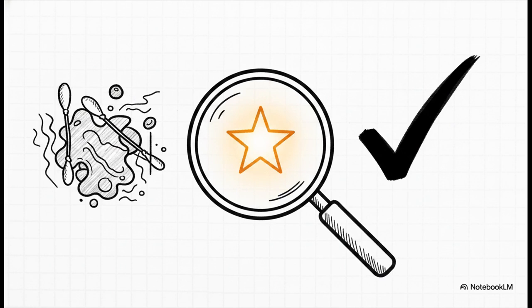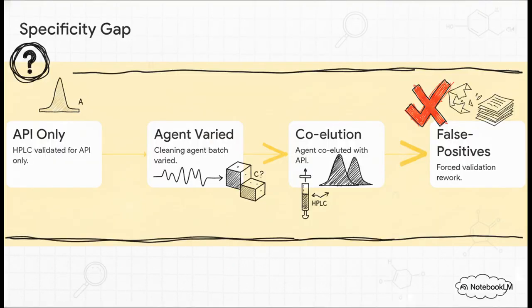This is your method's ability to distinguish the target residue from interferences, and the operative word here is realistic interferences. Honestly, it's just not enough to test against pure lab standards. Your method has to be smart enough to ignore the stuff that'll actually be in your real-world samples. We're talking cleaning agent residues, swab materials like cotton or foam, or even weird matrix effects from your facility's own rinse water. Here's another real-world failure for you, this time driven by a specificity gap.